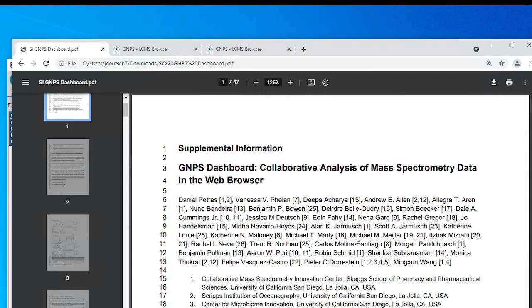In non-targeted metabolomics experiments, one can annotate about 1 to 10% of detected metabolites. To enhance our ability to decode the dark metabolome, we use a variety of in silico tools to aid our annotation efforts. Today, I will show you how to use the GNPS LCMS dashboard to generate XIC on chemical formulas suggested by the in silico tool Sirius with CSI:FingerID.